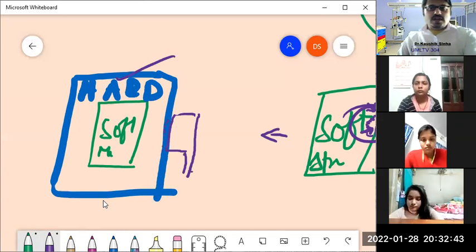Additionally, as this deformation begins to take a shape, when will it begin to take a shape? As this knife approaches this surface. From all the directions, there will be an opposition to this deforming force.